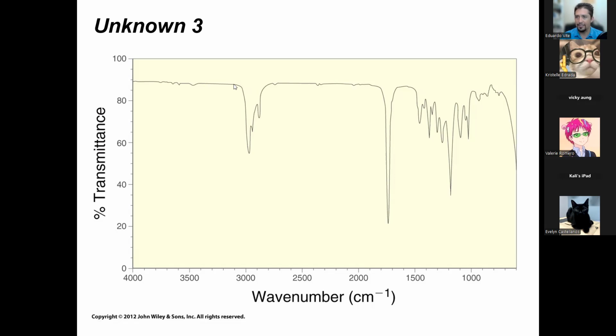Well, there's an alkane that's always there, right? But there's a very characteristic peak, the one that you should definitely know, the Bugs Bunny of the peaks, the SpongeBob of all of them. That's right. This time it is a carbonyl. Why? Because you went straight to 1700 and you saw a strong peak. Now notice it's not all the way to the bottom, but it is at 1700 and it's strong. 1700 and strong very likely means carbonyl.